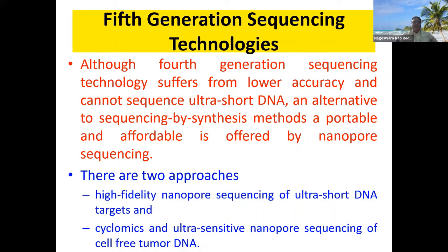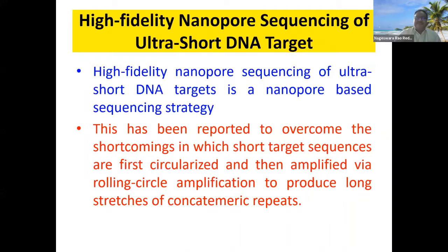Okay, and nanopore technology again. You can see the nanopore technology has changed its state, and DNA sequencing has changed along with the nanopore. Now there are two approaches here. First one is high fidelity nanopore sequencing of ultra short DNA targets, and second one is ultra sensitive nanopore sequencing of cell-free tumor DNA. These are the two different approaches which are available. High fidelity nanopore sequencing of ultra short DNA targets is a nanopore based sequencing strategy.